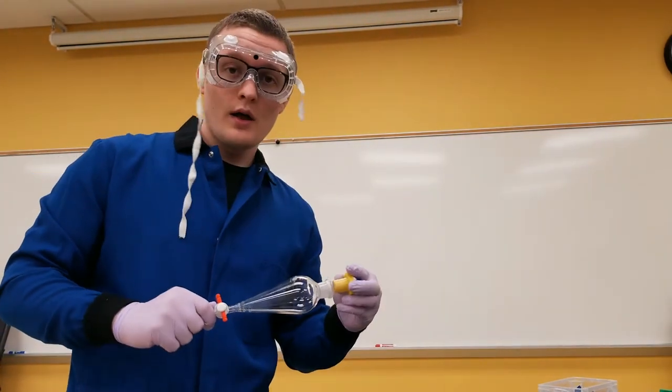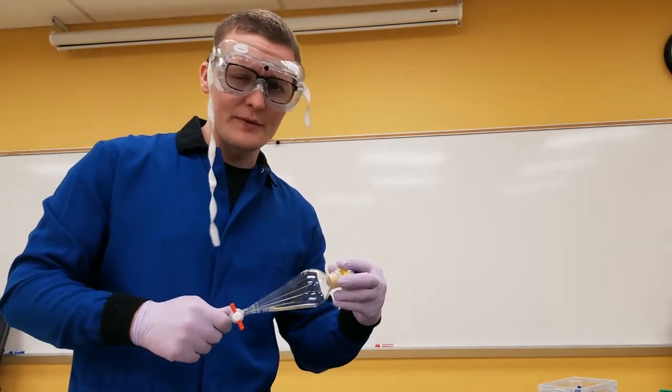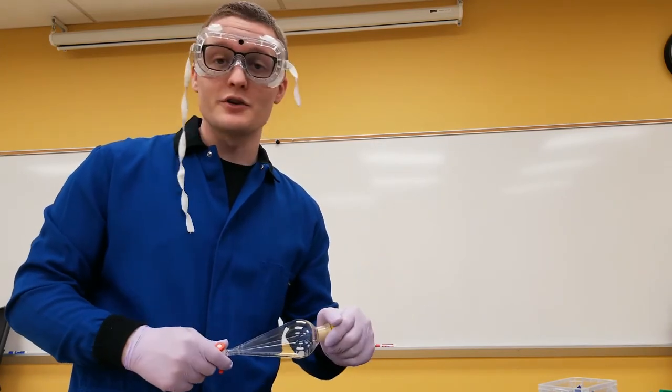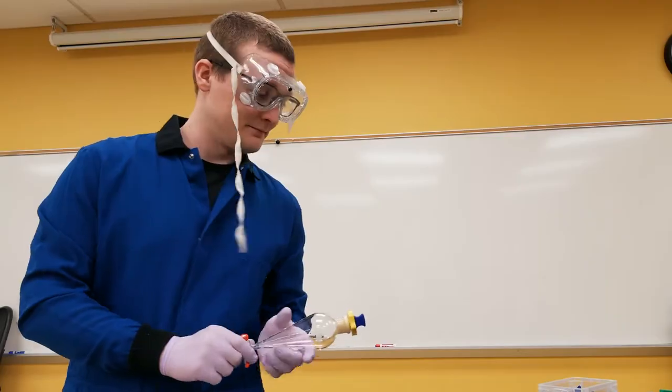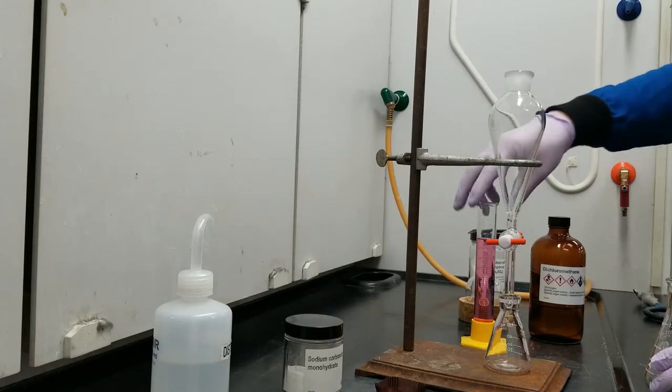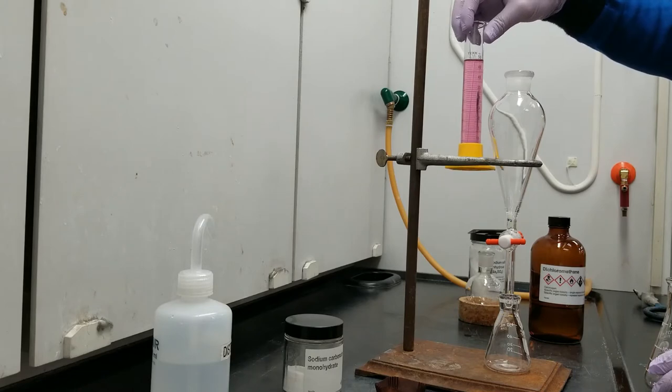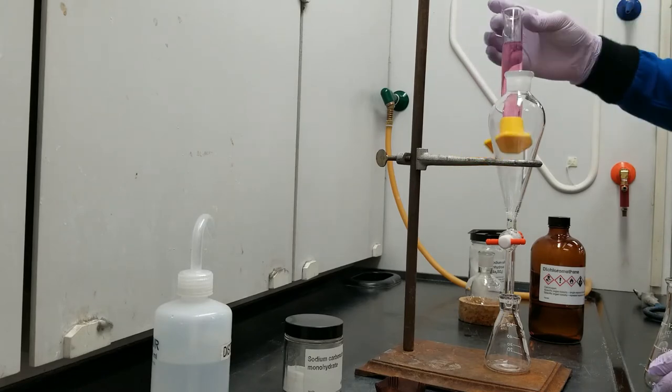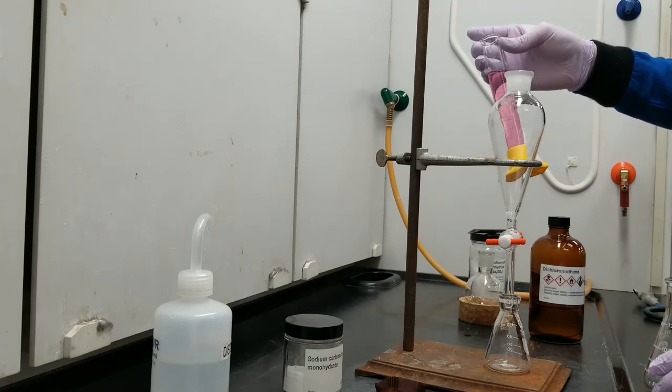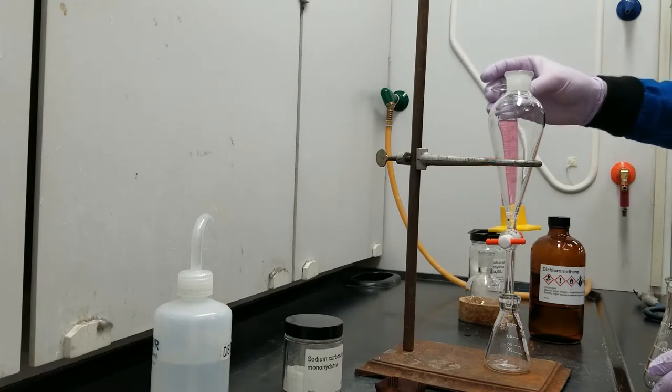So now, with those basic movements talked about, I feel ready to start setting up the actual experiment. Okay, so now that we've talked generally about separatory funnels, let's do this actual experiment here. So here is my beautiful grape energy drink. This is absolutely packed with caffeine, and in fact, I think that the stock room has spiked it with additional caffeine for effect.